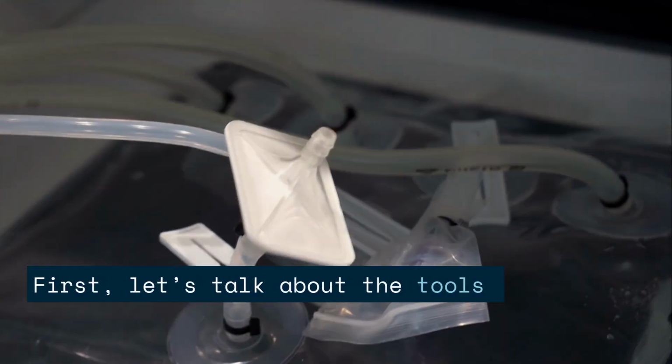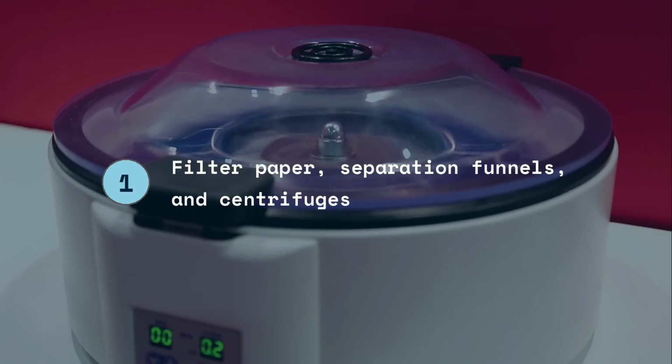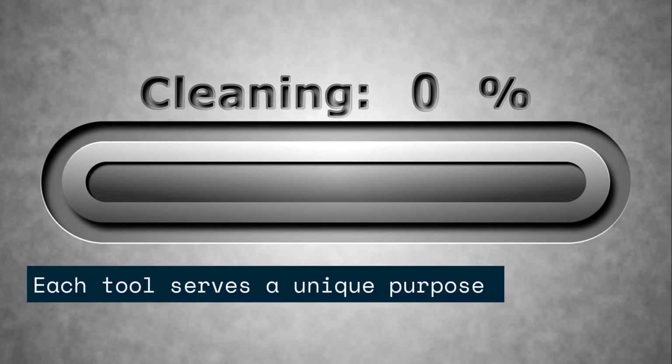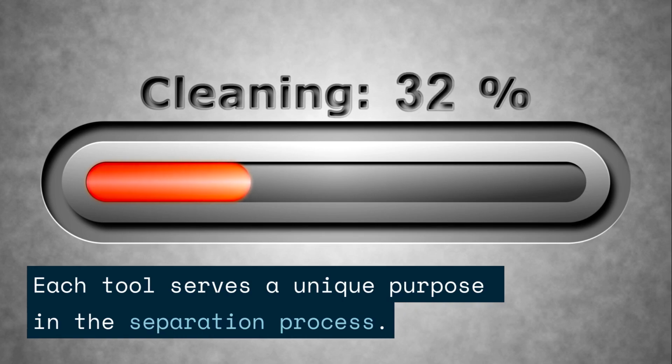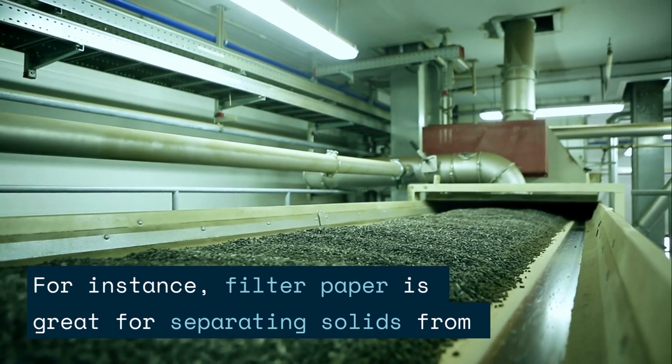First, let's talk about the tools you'll need. Essential separation tools include filter paper, separation funnels, and centrifuges. Each tool serves a unique purpose in the separation process. For instance, filter paper is great for separating solids from liquids.